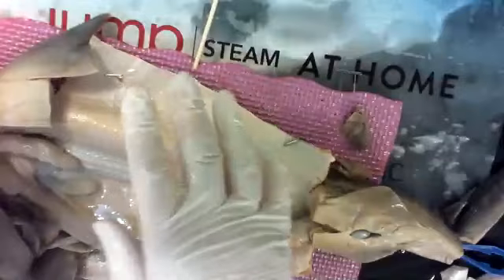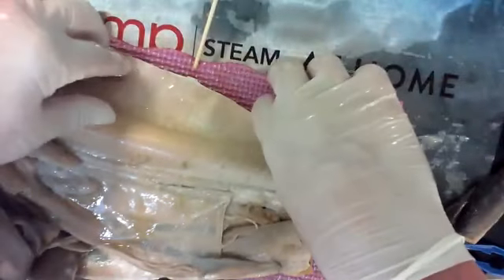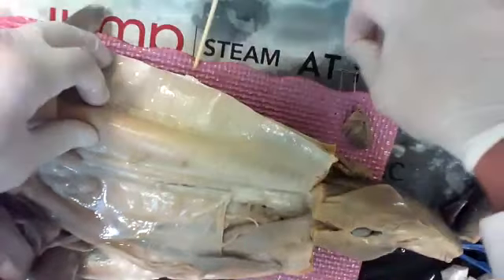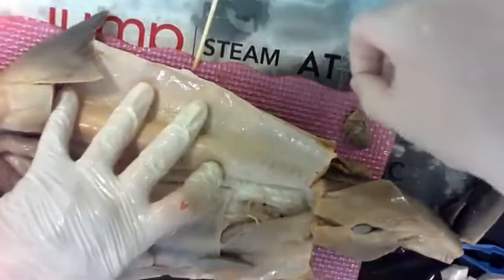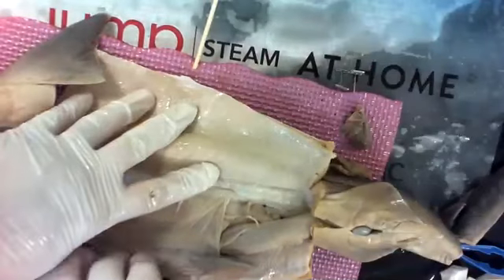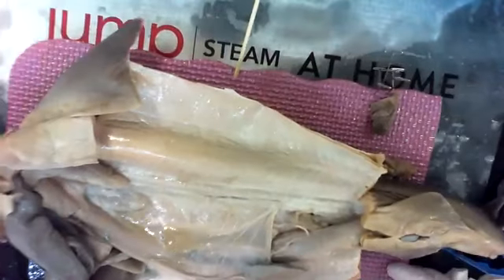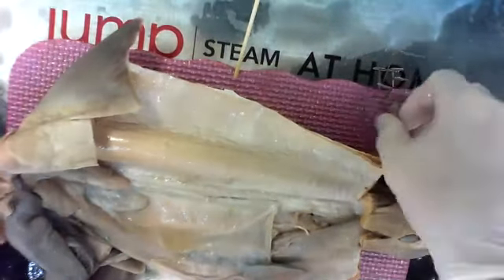All right, let's go back up to the eyeball. All right, I'm taking the pins out because I'm going to put everything back together. I have 2 pins already stuck. There's 3, 4, 5, 6 pins. I even have my heart here. I'm going to be courteous to the shark. I don't want to show any disrespect and do dumb things. So I'm going to put the heart back in.